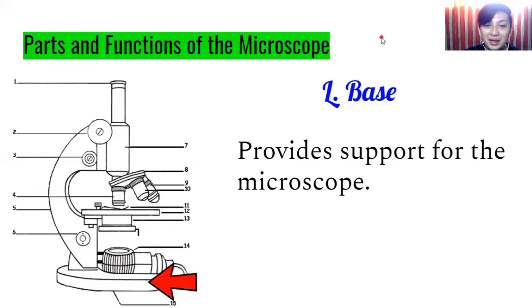So next is the base. The base provides support for the entire microscope. So importante yung base na yan. Kasi dyan yung foundation kung saan it supports the entire microscope.